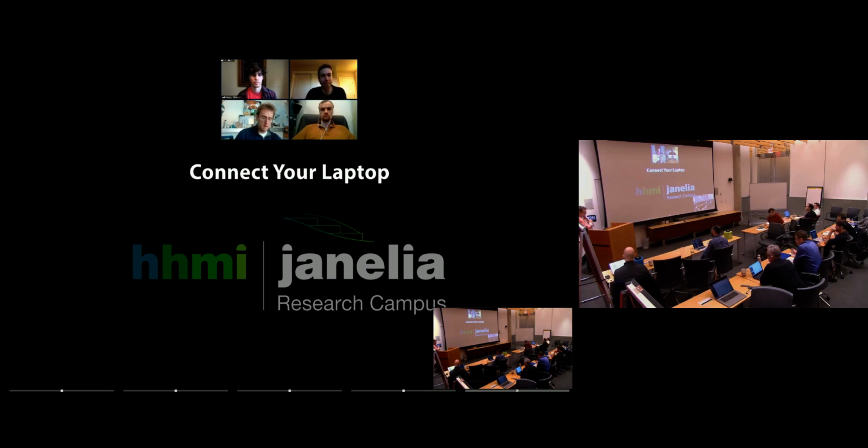So that's a little bit different than the tinkering development use case for Micro-Manager or for microscopy software development. But it does force you to deal with some of these user-facing issues about what it is like to run the microscope, how easy is it. Deployment becomes something that you actually have to care about, instead of it just working on that one rig that's attached to that one piece of equipment.